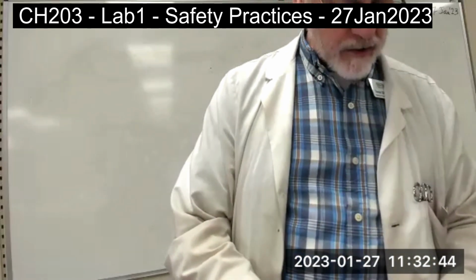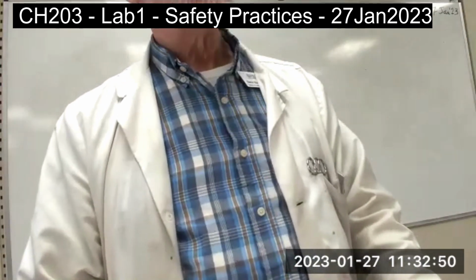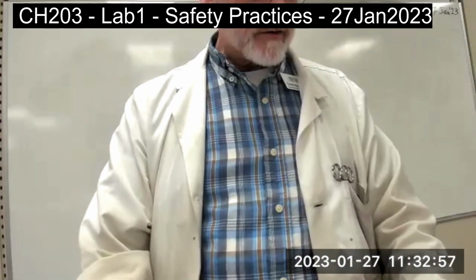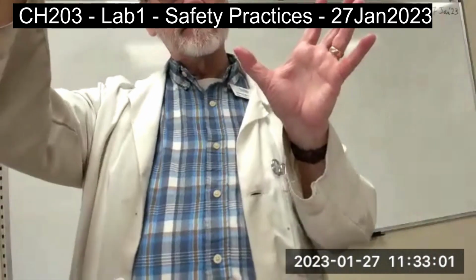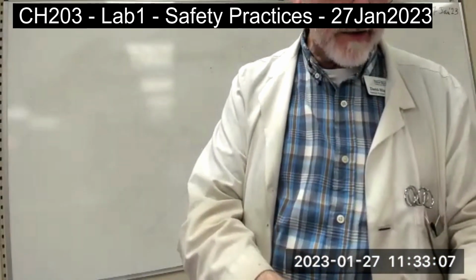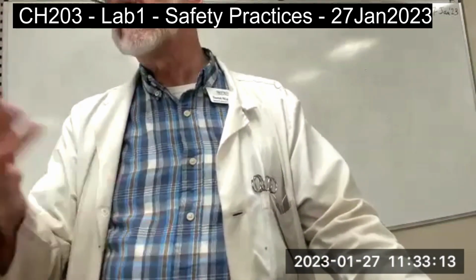And then you have these placards, right? I don't think we have any placards around here, do we? Maybe on the door. That describe hazards. It's kind of like a square tilted 45 degrees. The top one is for flammability, the left one is for health, and then the one on the right is for reactivity. The one on the bottom is for special information, whatever that may be.